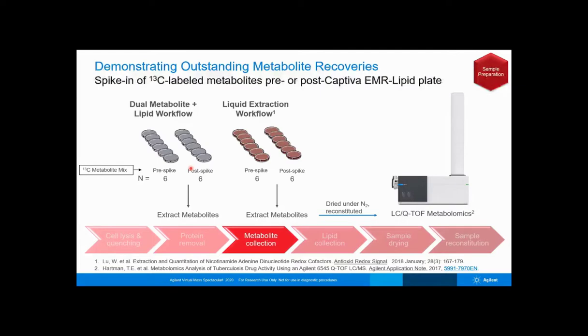For this experiment, there were 6 pre-spiked and 6 post-spike samples, and we compared the dual metabolite plus lipid workflow to a liquid extraction workflow. Samples were analyzed by LC-MS to find the carbon-13 labeled metabolite peaks.